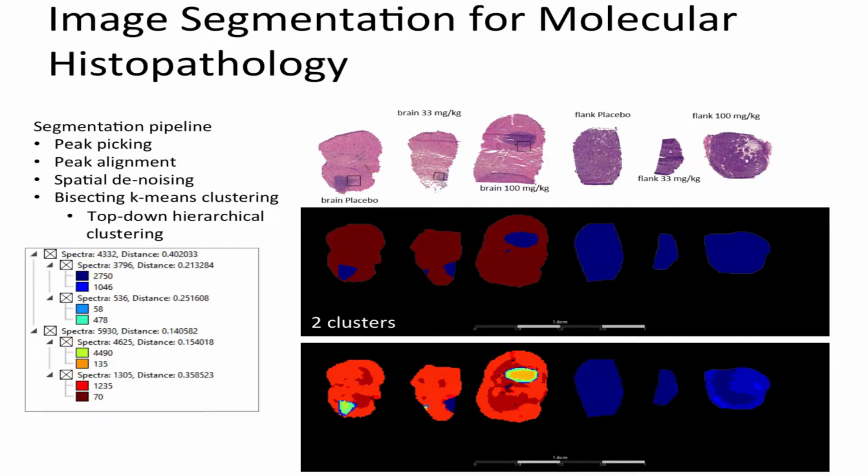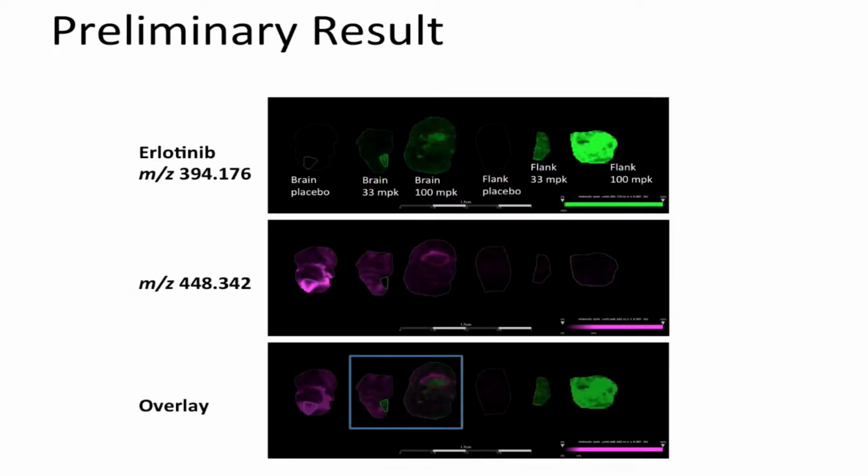But if we start subdividing some of those clusters here, we are starting to pick up some of the tumor heterogeneity that I think we could start using to be able to look at and correlate to drug distribution. So one of the first molecule of interest, if you want, if we look at here the drug distribution, this is the same layout that I presented before.